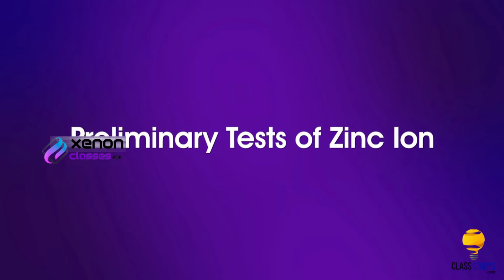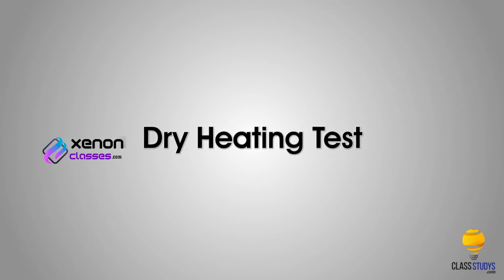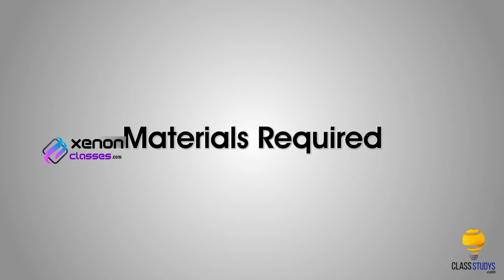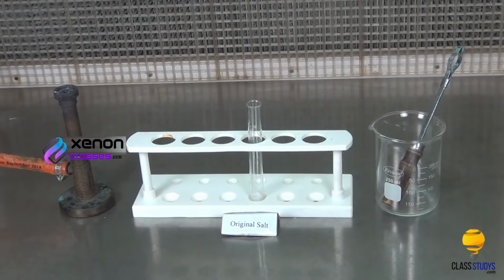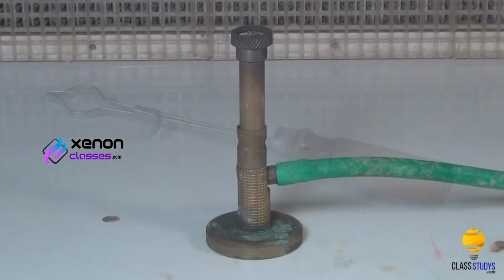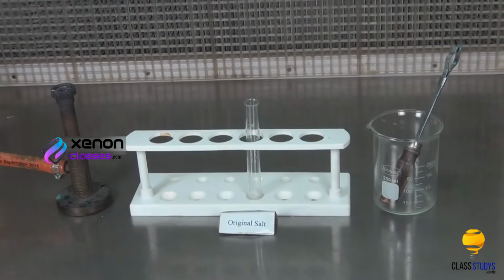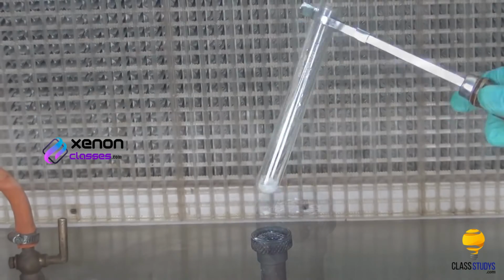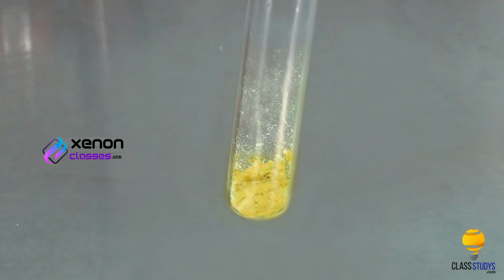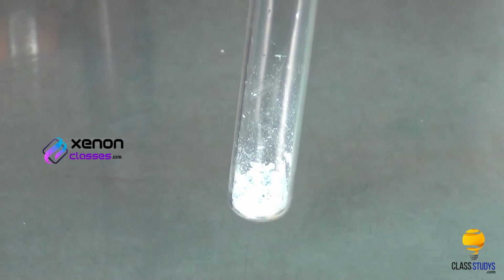First, we look at the preliminary tests of zinc ion. Dry heating test. Materials required: original salt in a test tube holder and Bunsen burner. Procedure: take a small quantity of salt in a test tube. Heat it over the Bunsen burner. The salt becomes yellow when hot and white when cold, indicating the presence of zinc ion.